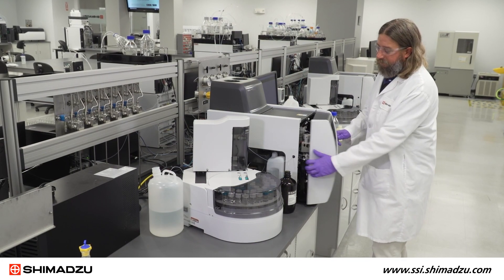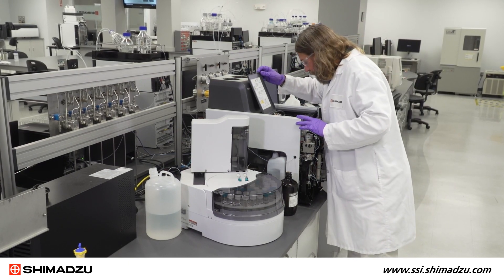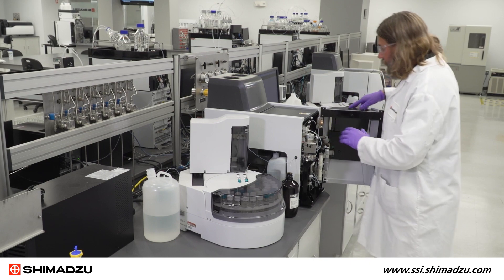If the instrument is used daily, then we recommend replacing the combustion tube with new platinum catalyst and the O-rings at the top of the combustion tube once a year.